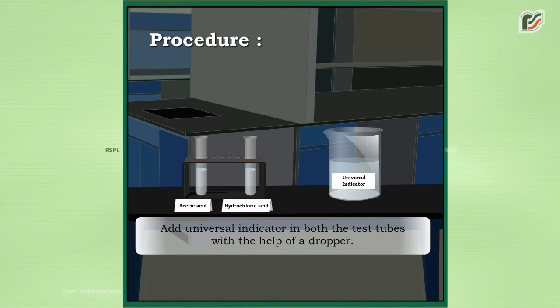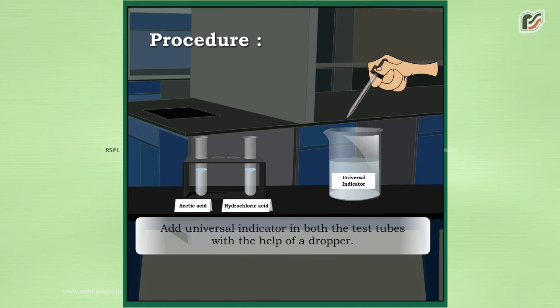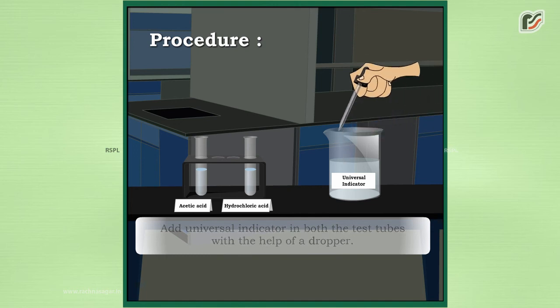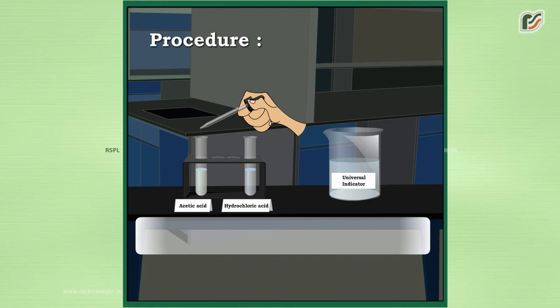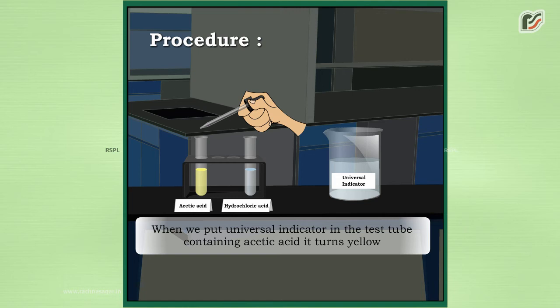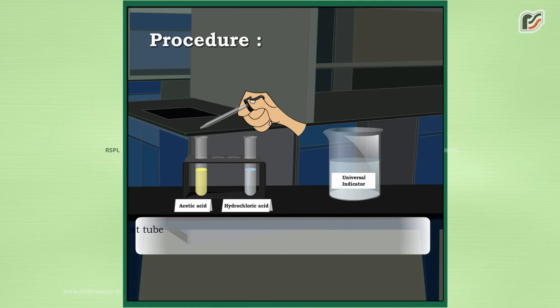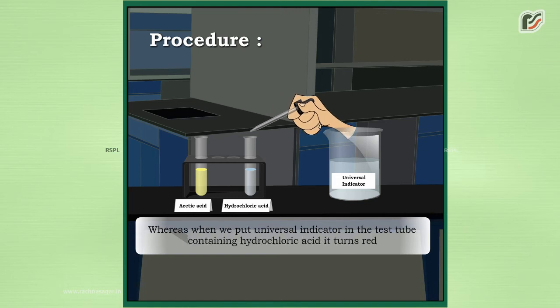Now remove the litmus paper and add the universal indicator in both the test tubes with the help of a dropper. When we put universal indicator in the test tube containing acetic acid it turns yellow, whereas when we put it in the test tube containing hydrochloric acid it turns red.